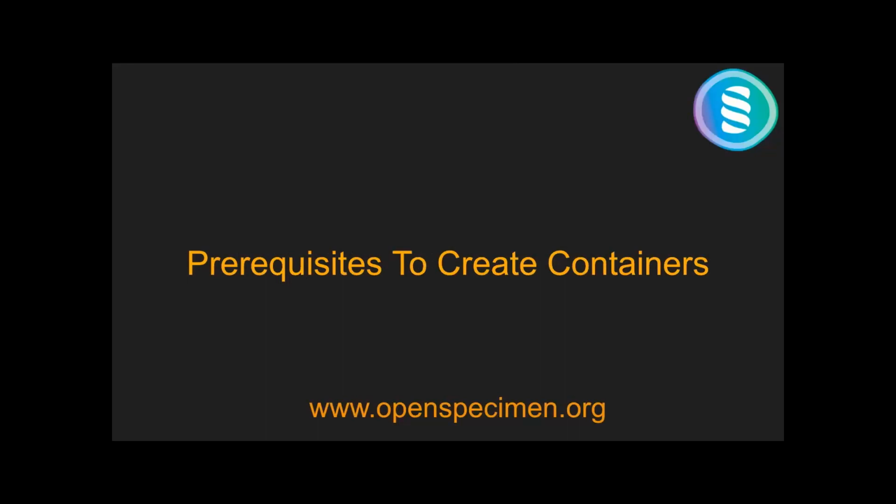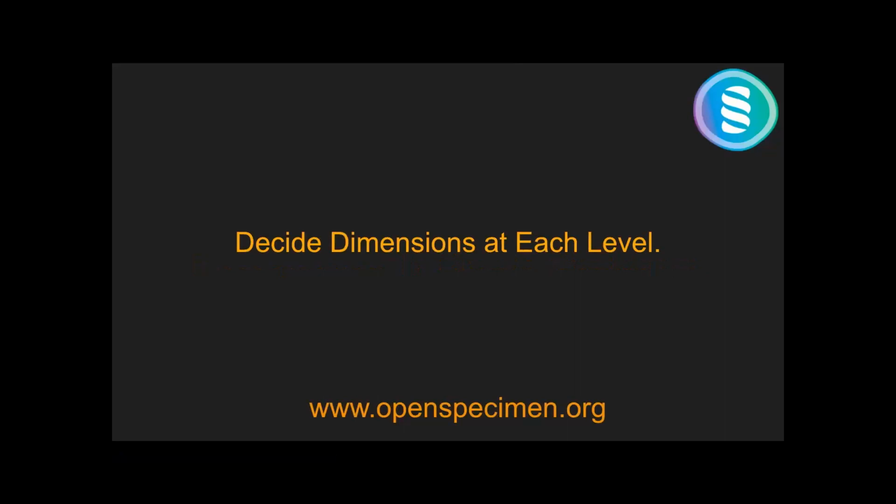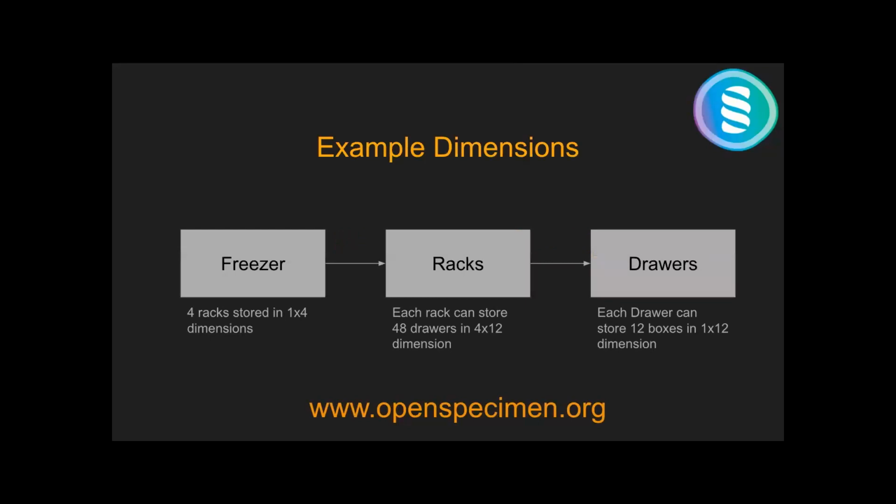Now, what are the prerequisites to create containers? There are a few prerequisites. The first one is you need to decide dimensions at each level. What does that really mean? For example, I have a freezer that contains 4 racks. So my freezer dimensions will be 1 by 4: I see 4 rows and 1 column when I open the freezer door. Now, if I open an individual rack, I can see 48 drawers stored inside. I can see 4 columns, and 12 drawers are placed one above the other.